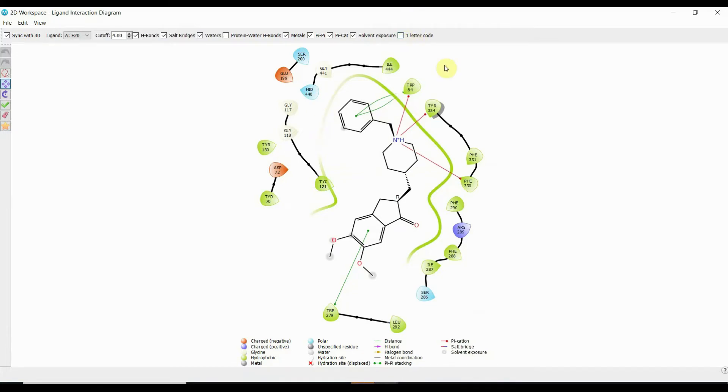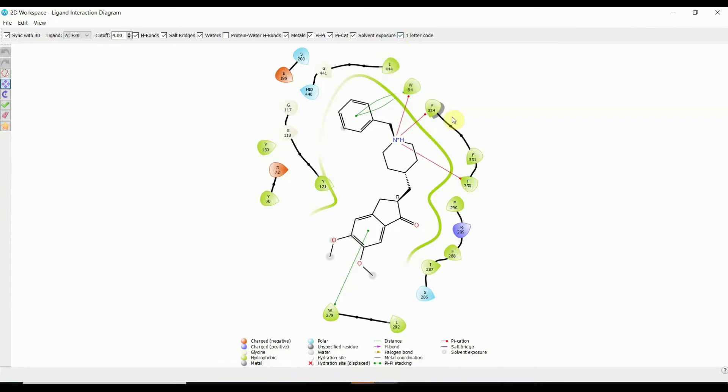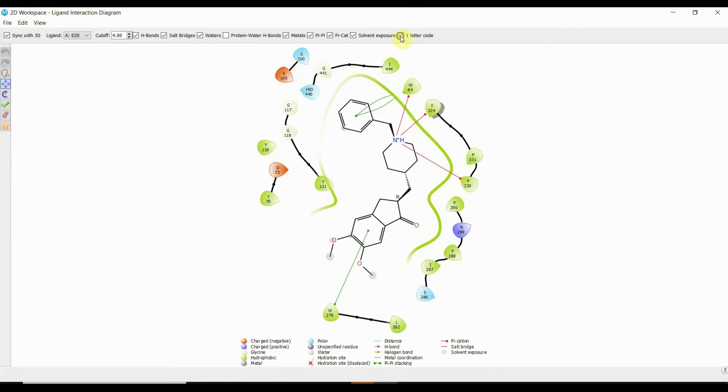If you do not want to see the three-letter codes and are only interested in one-letter code, what you have to do is click this option and you will see that they have now converted into one-letter code. They are not now written in three-letter codes, only in one-letter code.